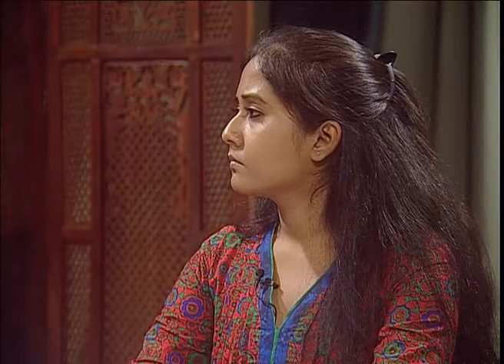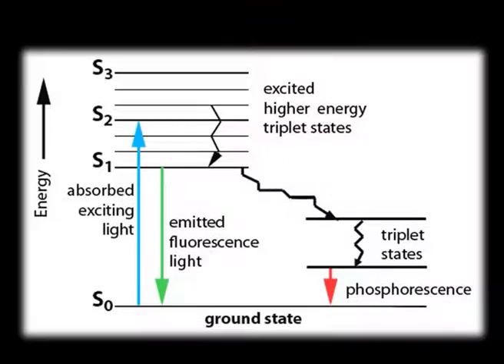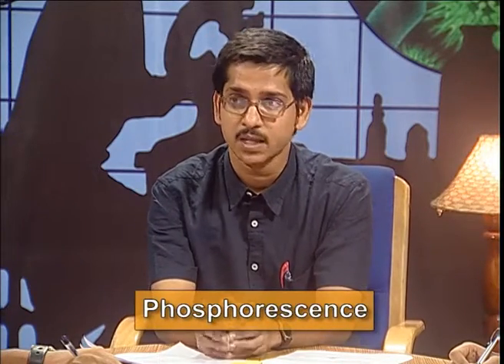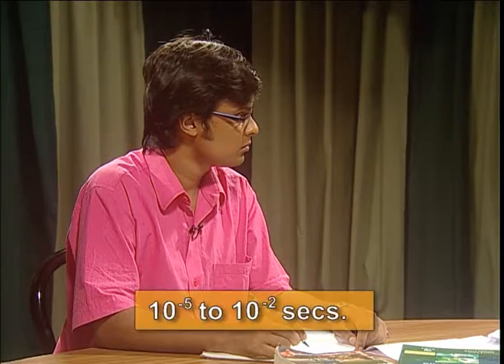Now, along with fluorescence, there is another phenomenon which can happen to certain molecules. After the absorption, the electron goes to its excited state. Then, rather than coming to the ground state, it can hover into a triplet or a metastable state. It can stay there for some time and then come down to its ground state, releasing the energy in the form of a photon, but that phenomenon is known as phosphorescence. Now, the time span for phosphorescence can vary from 10 to the power minus 5 seconds to 10 to the power minus 2 seconds.